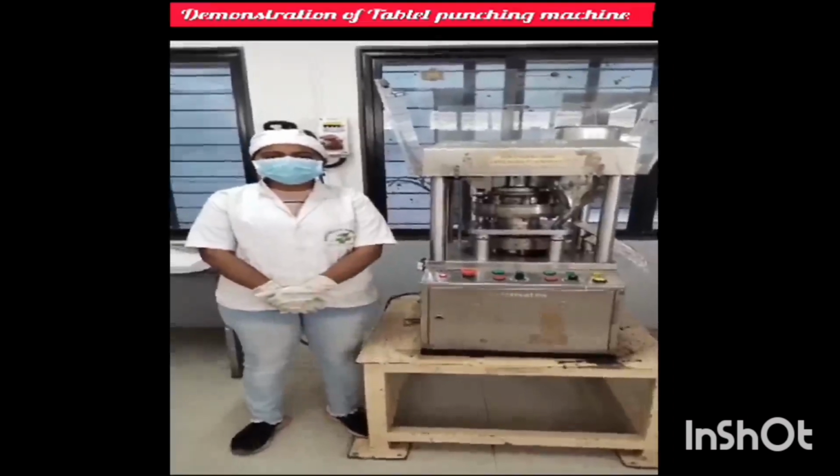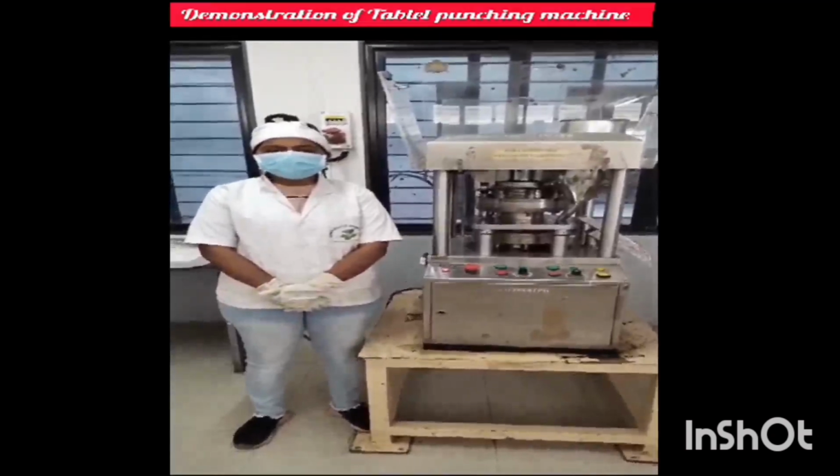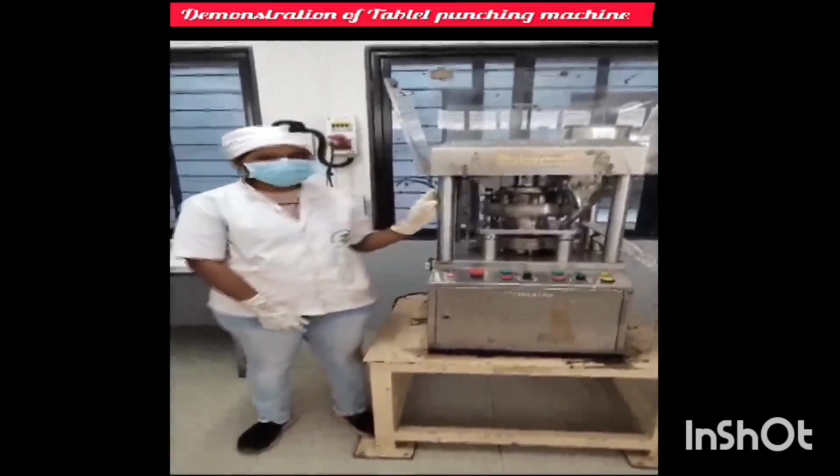Tablet punching machine is used worldwide to prepare the medication as it is accurate and gives precise unit dosage form by maintaining the uniformity for the dosage form. Now we'll see what are the various parts of this tablet punching machine.